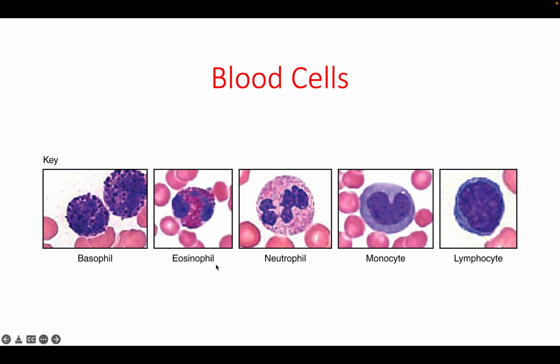If you can see two lobes of the nucleus, two distinct regions, and it's kind of this reddish orangish color, right? You look at the other ones, there's no reddish orangish or burgundy pinkish going on here. This deep pink stain is staining for the eosinophil. You can distinctly see two nuclear lobes, two nuclei. Okay, kind of looks like this one's stringing off a little bit, but this is one and two nuclei. Eosinophil, two nuclei.